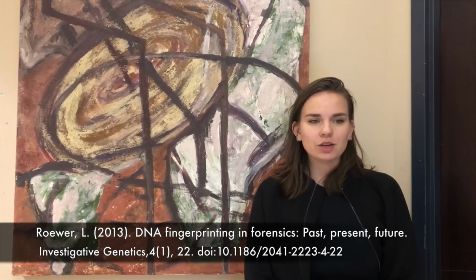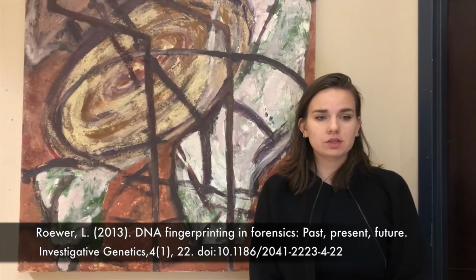To confirm that no students in Bio393 lab helped, cheek swabs were analyzed. According to a study from Rower done in 2013, only very small amounts of DNA can be extracted from the cheek swabs at a time. You will use the polymerase chain reaction, PCR again, to amplify your sample so there's enough DNA to be visualized. So how do you even store this DNA?